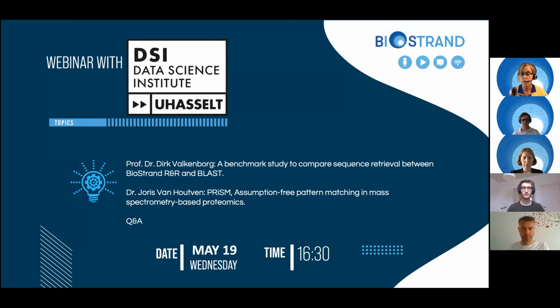And why patterns? Well, BioStrand has developed a completely new methodology for omics data analysis in which we use patterns to do all the work and to perform all the tasks in bioinformatics. And then in the research of Joris Van Houtven, patterns play a key role in designing a very exhaustive and comprehensive way of searching through and analyzing the mass spectrometry data.